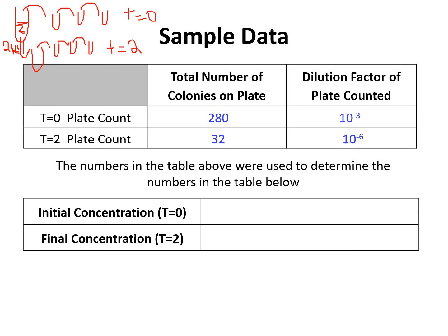Now, if you think about it, when you incubated your original batch for an extra 2 hours, what does that mean? It means that you're allowing the bacteria to grow further for 2 extra hours. So you're definitely going to have more bacteria growth. If I'm going to have more bacteria growth, wouldn't you guys think that you will have to do more dilutions the second time around? Yeah. So the second time around, it would actually require you to dilute it more for you to get a plate that falls within the golden rule.